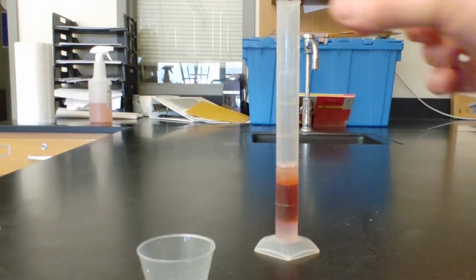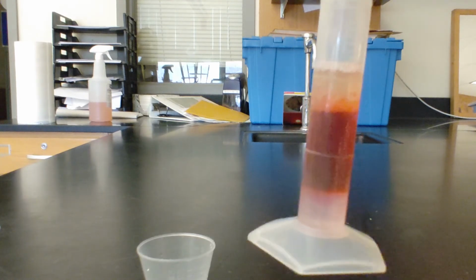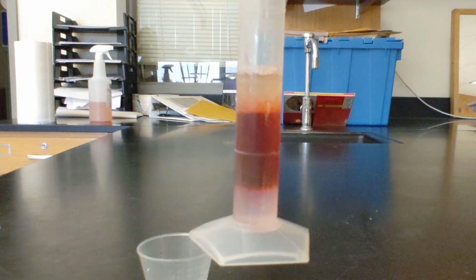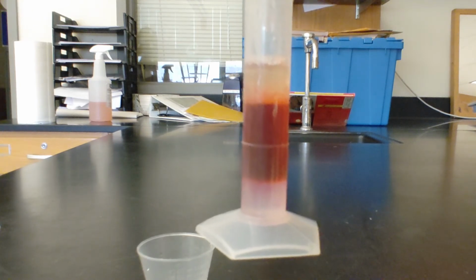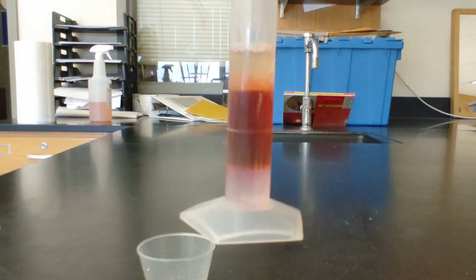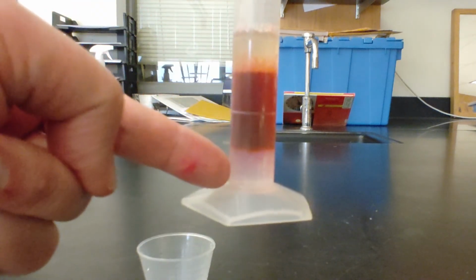Letting them settle out a little bit, you notice that there are differences between each one of these substances. The one that's on the top is the vegetable oil, right up here, and at the bottom we have the glycerin.